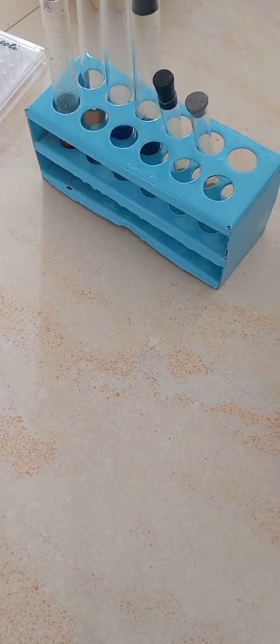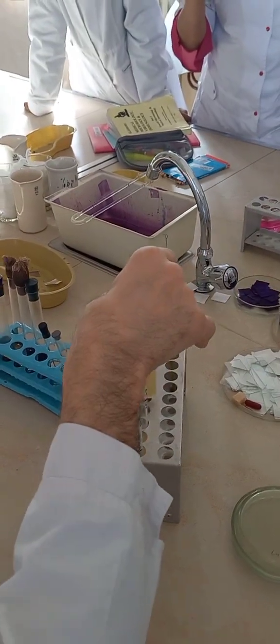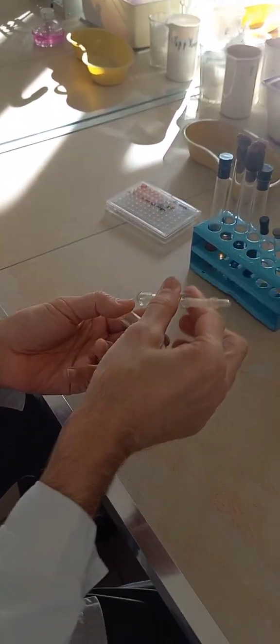Visible? No. Yes. It's small. I try to soak them with hydrogen peroxide. Step by step, not intensive but present, especially surrounding microbes. So, okay, this is a moderate activity, I have to say, and in reality it's a species feature of this bacteria. Now, it looks like, in my opinion, the first type of colonies.